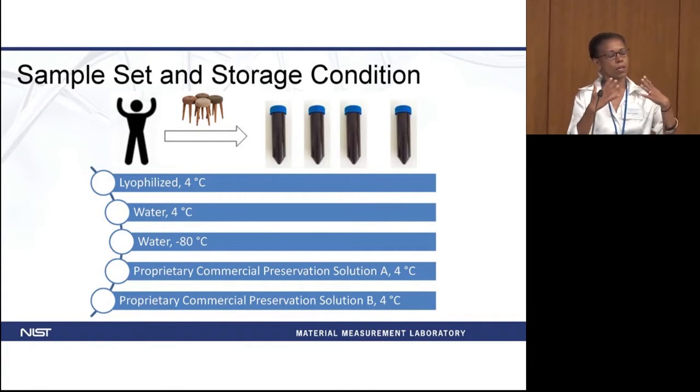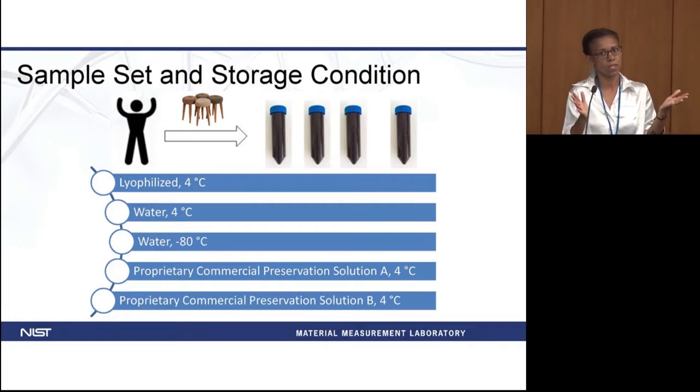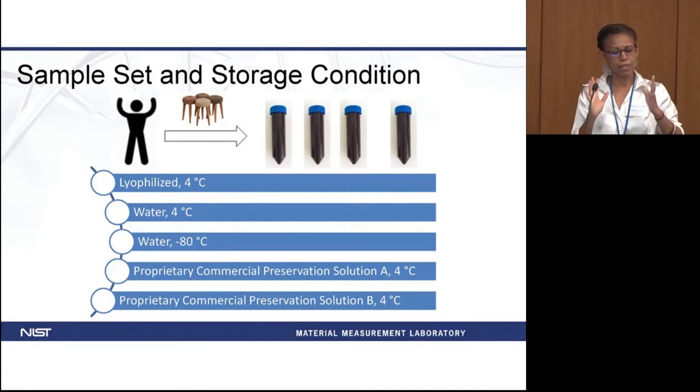I wanted to point out that, from everything I have heard about sampling the gut microbiome, the preservation method was usually always targeted at the DNA. It doesn't matter what happens with the cells as long as the DNA is intact. So now I think the picture has changed a little bit.